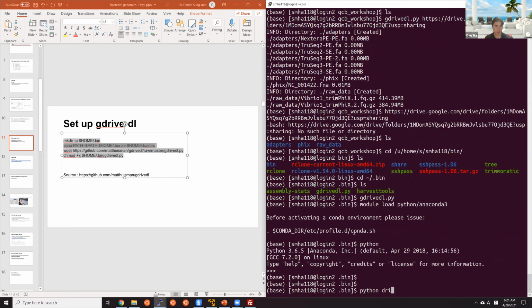Can you actually try it with the Python in front? Python gdrive dl.py, and then URL. Okay, let me try that. Okay, it's working now. I think that's what it was. Okay, cool. Great. Thank you.